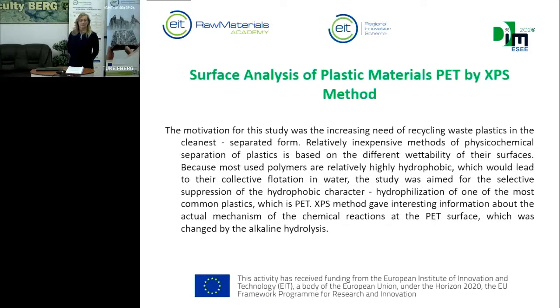Because we are the faculty of ecology, we tried to prepare and characterize some problematic waste materials. It is plastic materials, and we tried to select them and characterize them by the XPS method.